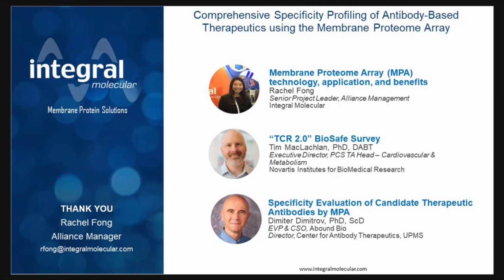Thanks, Elizabeth. Yes, that's a good question. Today we focused a lot on the specificity testing application of the membrane proteome array, but as I'm sure many of you can deduce, this platform is also amenable to what we refer to as deorphaning or receptor identification. And we do perform a lot of those types of projects as well. It's basically the same format in terms of the technology and what we do. It's just answering a different sort of question. So yes, deorphaning or receptor identification work can definitely be performed on the MPA.